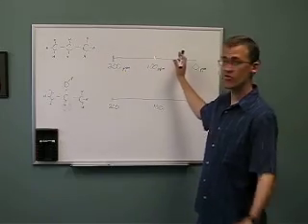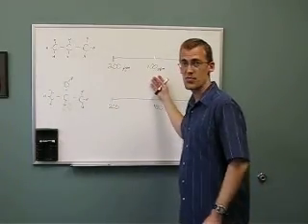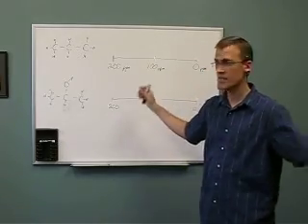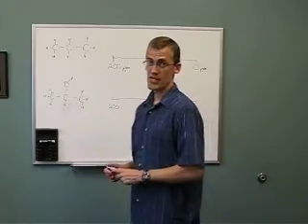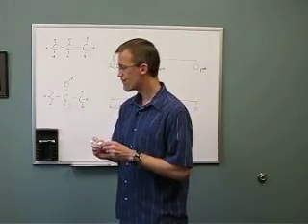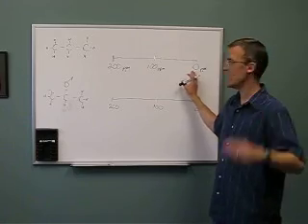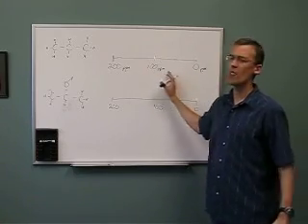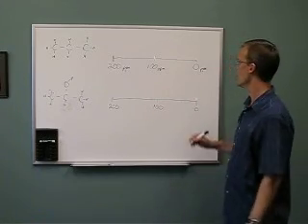Well, in lab you're going to be working through some of this where you're predicting what the spectra look like. At one point you're going to collect a spectrum, so you're really working the other direction. But if I'm looking at propane and trying to figure this out, basically on this axis, what we call 0, the carbons will resonate in the scale from about 0 to 200 parts per million. It's somewhat artificial that we create.